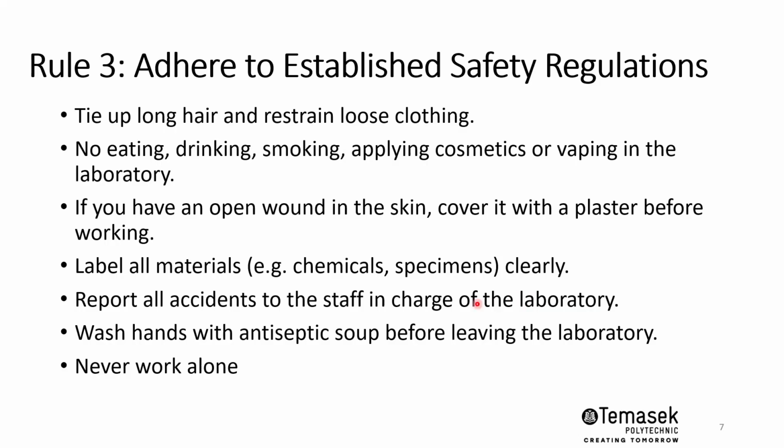Label all materials, be it chemical or specimen, clearly with a marker, so that we will know what the container contains. You will come across many chemicals that are colorless. You won't even know what the chemical is, so it's important to label them accordingly.